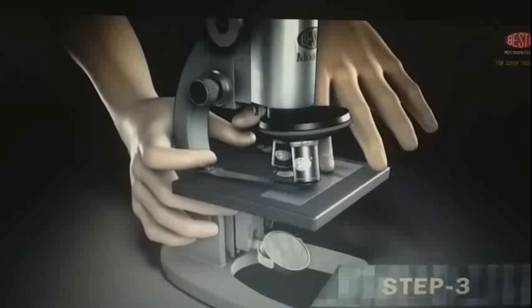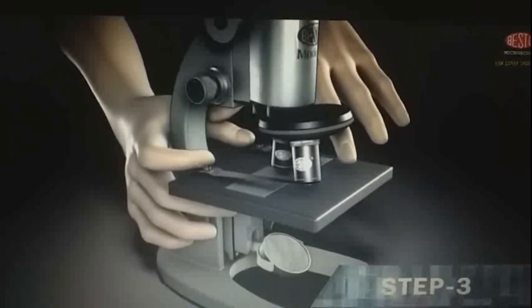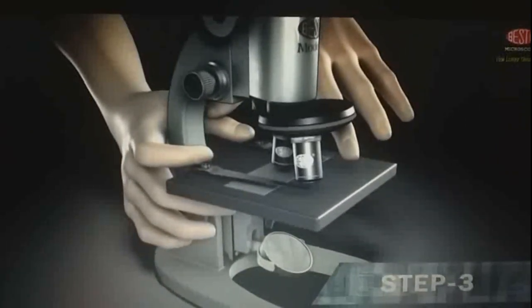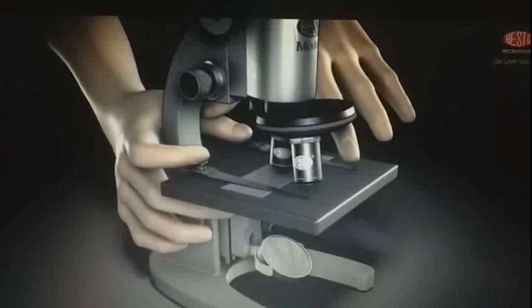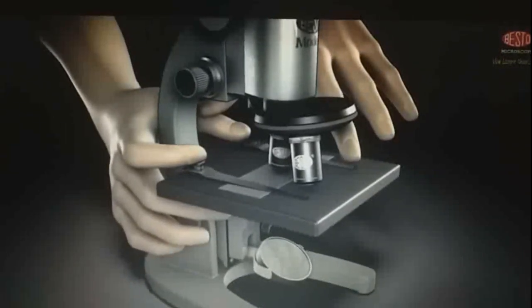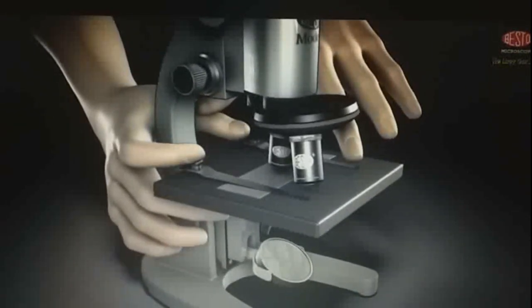Step 3. Put the slide in the stage so that the center, the bit you want to look at, is over the hole and under the lens. Use stage clips to hold slide in place.